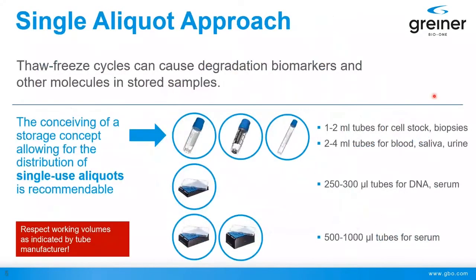And this storing in smaller volumes is actually one aspect I want to now spend a slide with, because I find it's important to think about it and also deduce some good practices from it. It is the fact that we should think about the volume of a sample we need at the very end. An end user, a researcher, or whoever is carrying out an experiment requires to get his data.